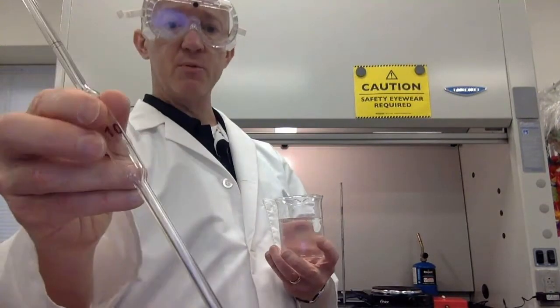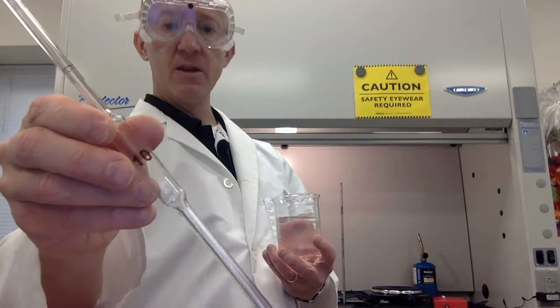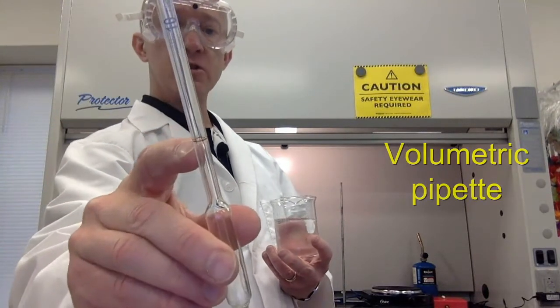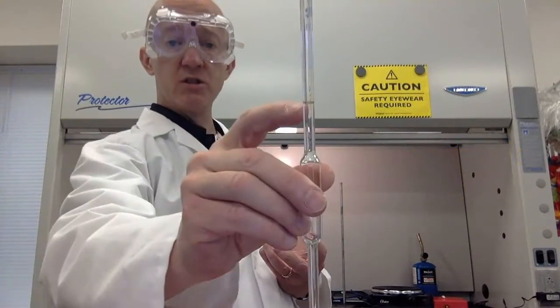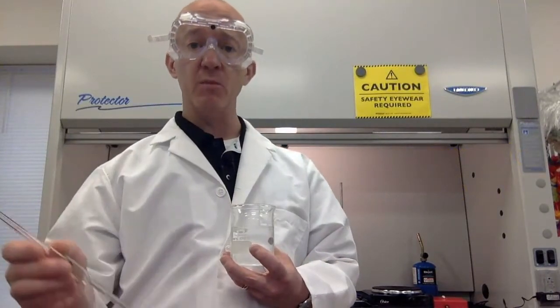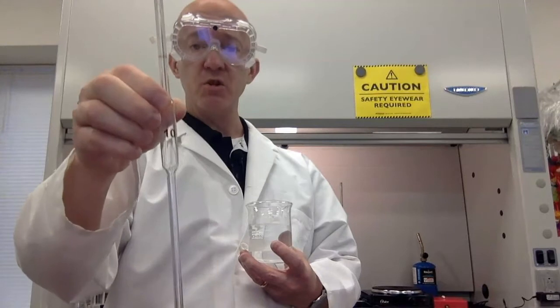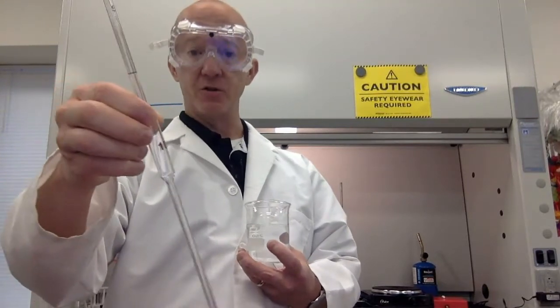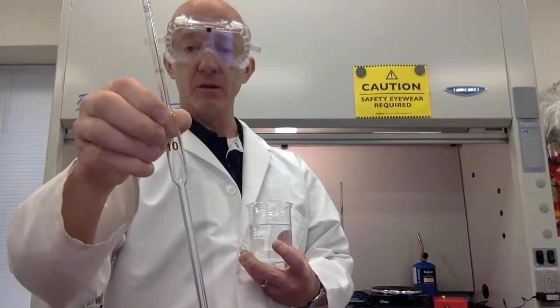We also have some that give us very precise measurements. This is a volumetric pipette. And again, notice the little line right there. We use this line the same way we do for a volumetric flask. We want to transfer exact amounts of liquid. This one happens to transfer exactly 10 milliliters.